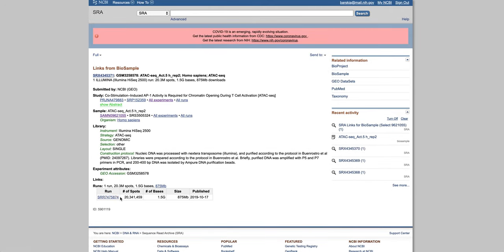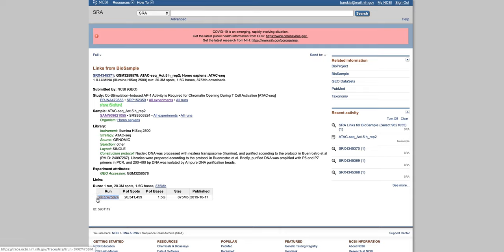And this is what we need. We need this ID number, SRR 747, and so on. And you can also see that this is ATAC-seq experiment, and layout is single.